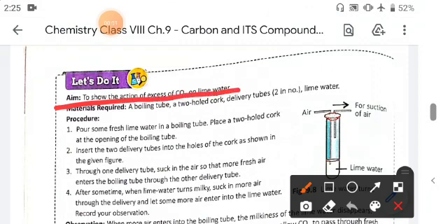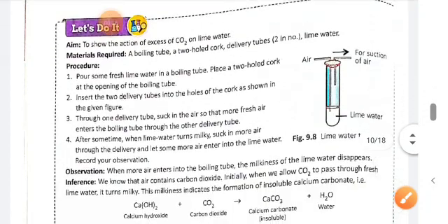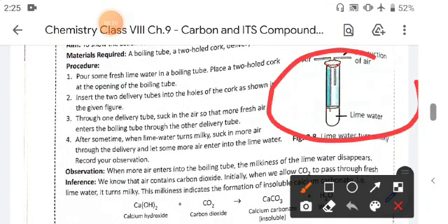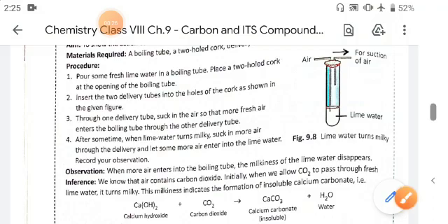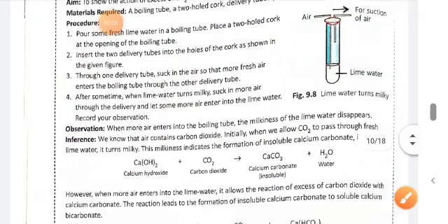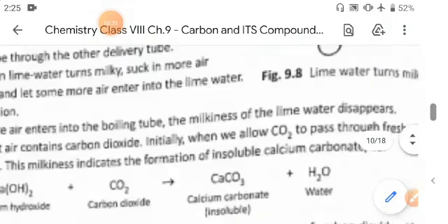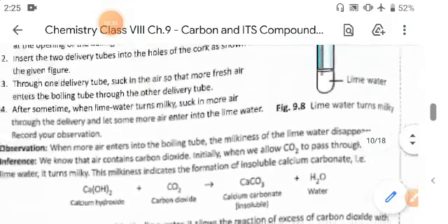We will show the action of excess CO2 on lime water. You know that here is a test tube in which there is lime water. When carbon dioxide passes through this lime water, it will convert it into milky form.